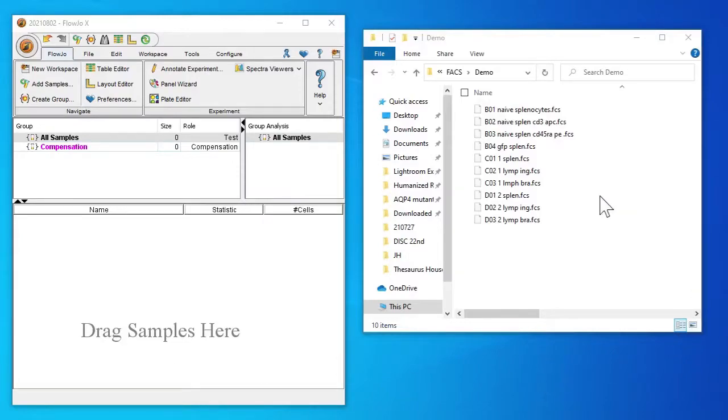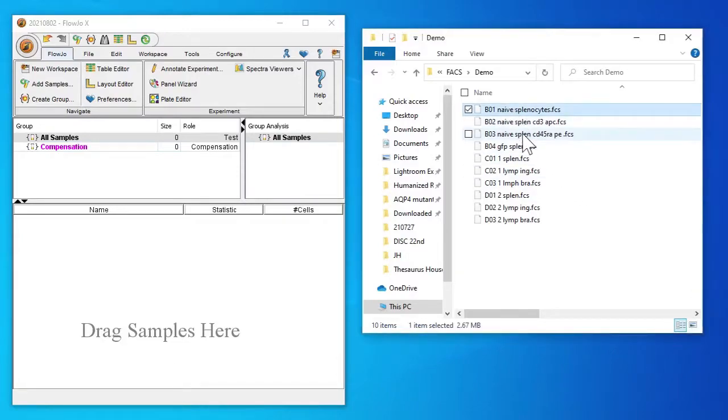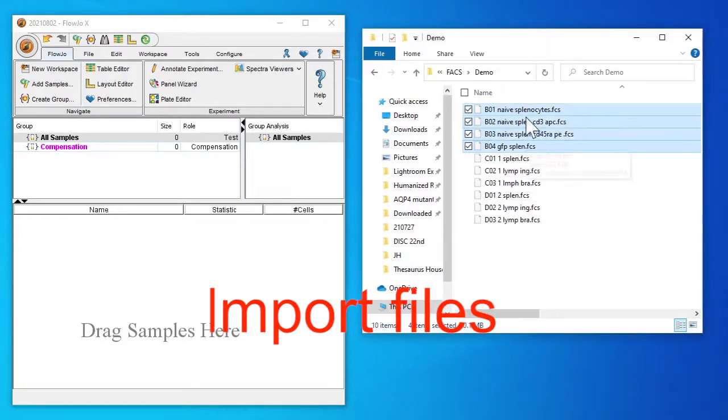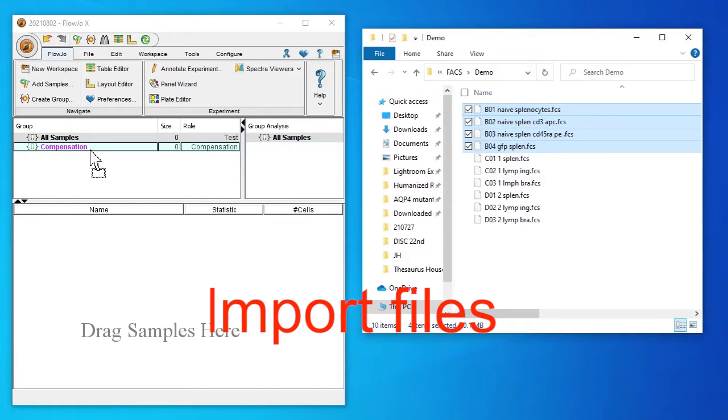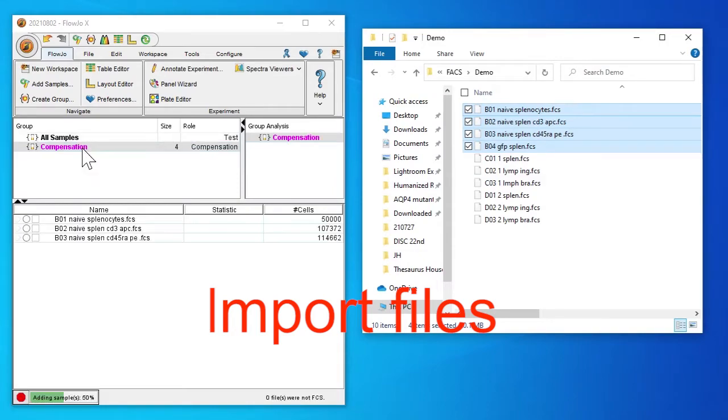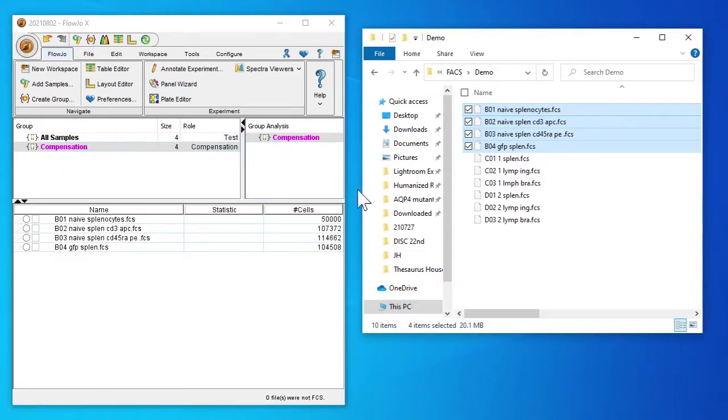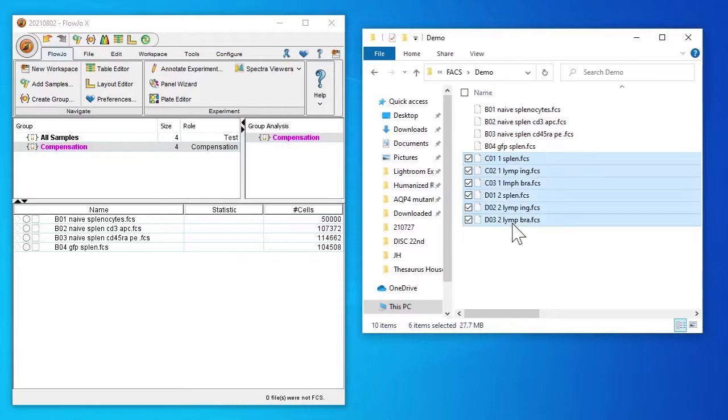Okay, FlowJo today. First we're going to start by importing our files. We'll import our single-stained controls and also our non-stained control. Next I'll import our samples of interest.